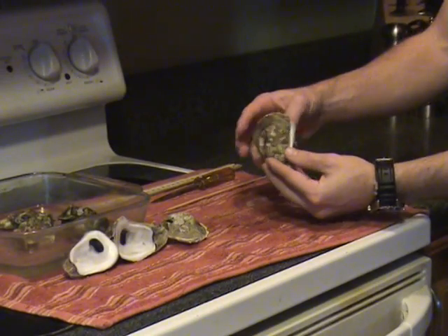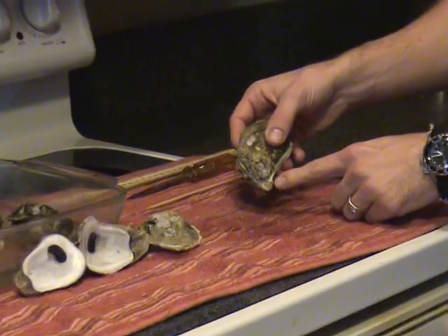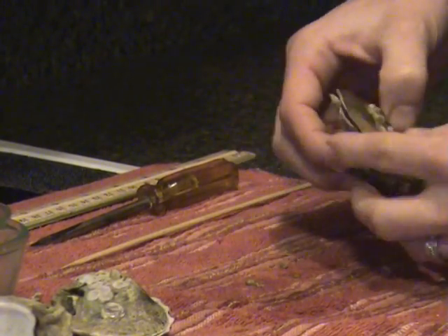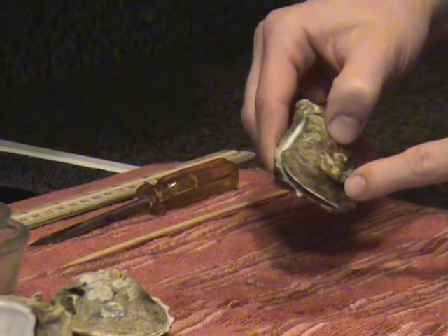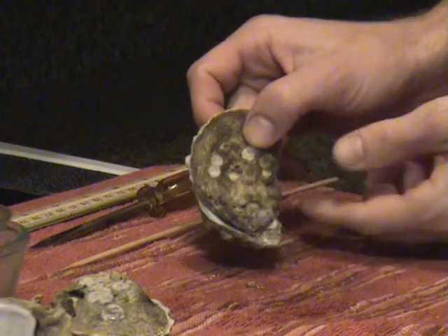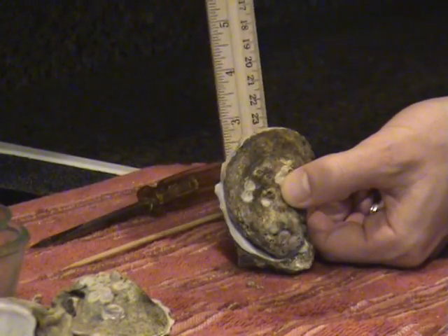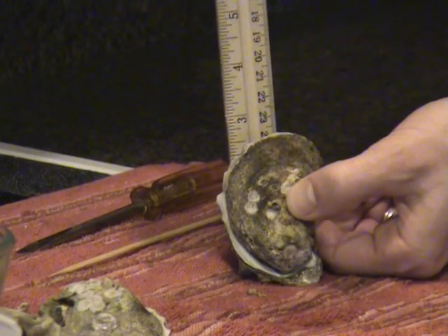The oyster is more pointed at one end. This is the anterior end called the umbo. The posterior end is the larger, curved end called the bill. The height of the oyster is the distance from the umbo to the bill. This oyster is approximately 2 and 3 quarters inches.